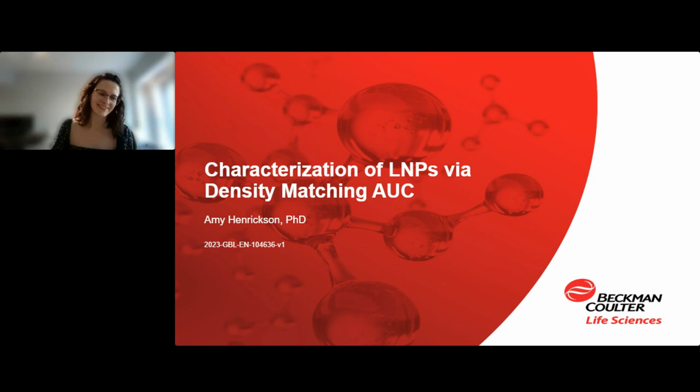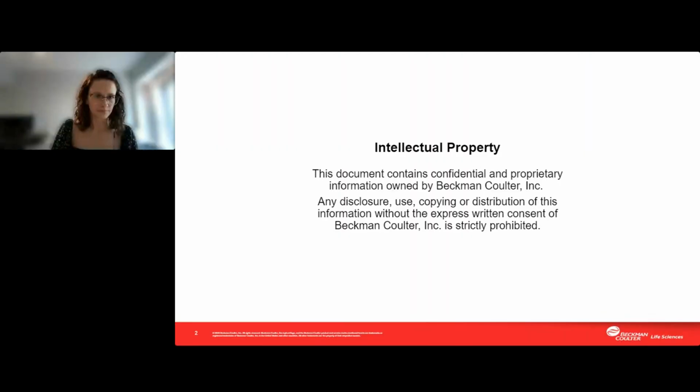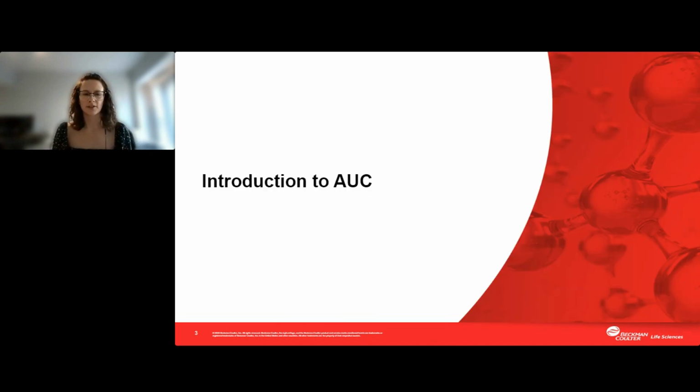Wonderful, thank you. So my presentation is about the characterization of lipid nanoparticles using the analytical ultracentrifuge from Beckman Coulter. First, there's just a brief disclaimer that the document here is confidential and belongs to Beckman Coulter. The first part that we're going to start with is a brief introduction to AUC.